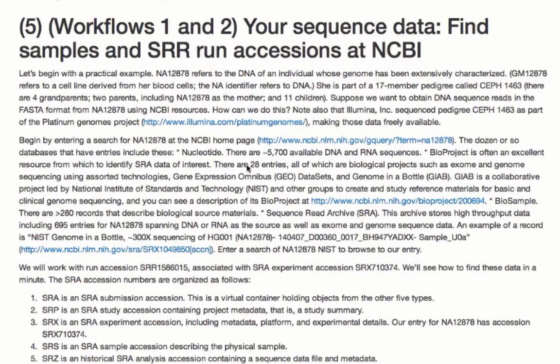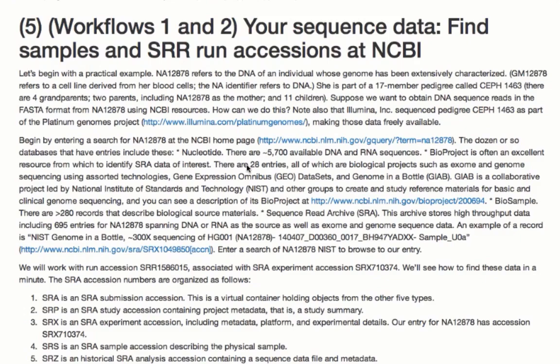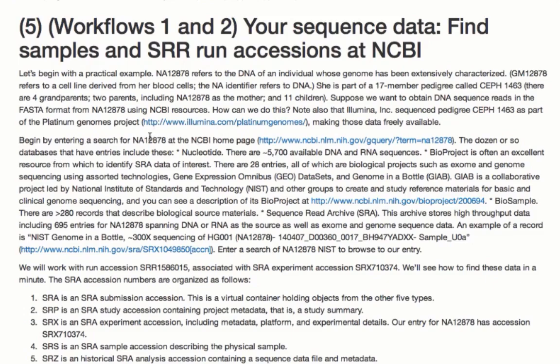Now we are at step five. We're ready to get some sequence data. We want to find some samples of interest at NCBI and what's called SRR-run accessions. We'll begin with a practical example of NA12878. This is an individual whose genome has been extensively characterized. NA refers to the genomic DNA. While GM12878 refers to the cell line that you can obtain from CORIELL, C-O-R-I-E-L-L. That's the cell culture repository in New Jersey. NA12878 is part of a CEF pedigree that's very well characterized. And you can see the whole genome sequence reads, for example, at the Illumina Platinum Genomes Project that I give the link to. We'll do this live. Let's take a look at the NCBI website. We'll enter the search term NA12878 and look for the different entries we can find.